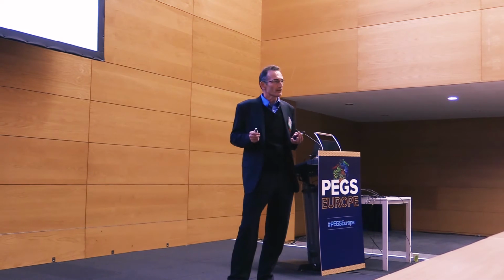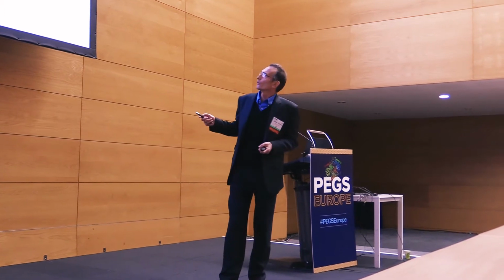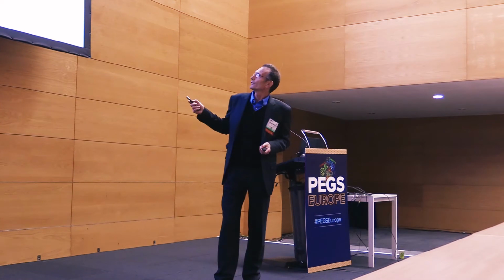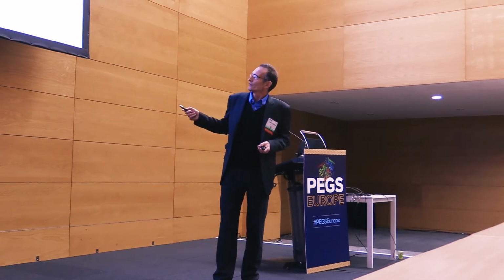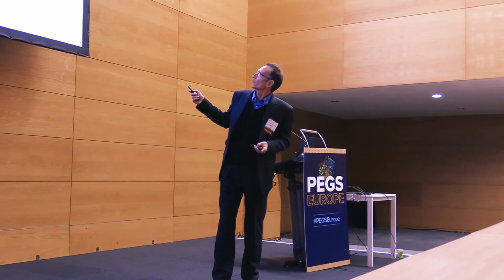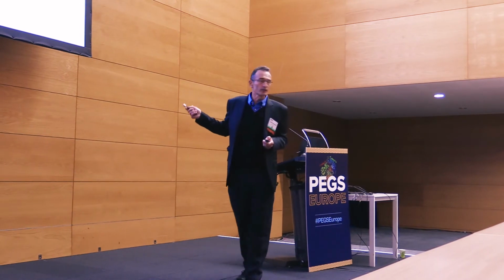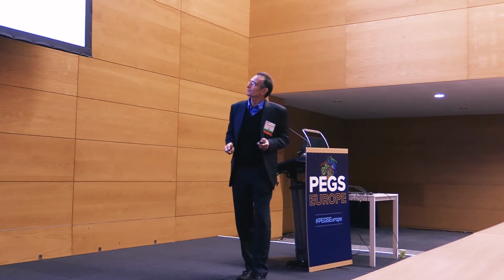And we chose them on the basis not just of the liability-free nature of their scaffolds, but also on the basis of their genetic diversity. So you see we have VH1, VH2, VH3, VH4, and then VH1 again. And these are coupled with kappa1, kappa2, kappa3, kappa4, and lambda. These have very low immunogenicity rates, and these are all determined in patients, and this one hasn't been done.